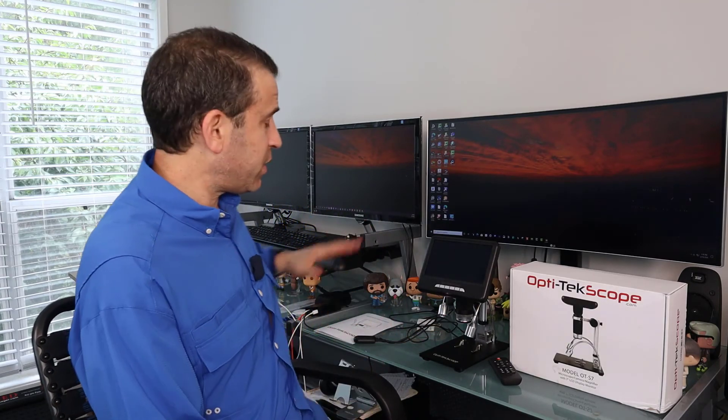Looking forward to showing you some examples. I've got some great products where we can dive in and also I'll show you how easy it is to put together. What's great about these microscopes is whether you want to just have some fun, your kids want to really dive in and look at something real close, or you're a professional wanting to work on circuit boards. So across the board, so many great and fun things you can do with it. You can really adjust the settings, coloring, and all that good stuff.